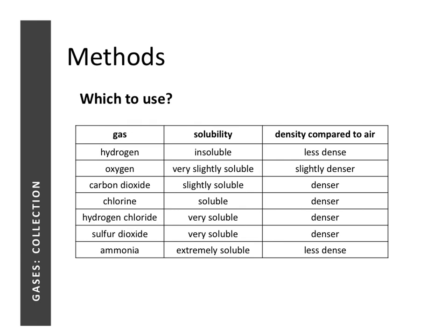So to apply what we have learned in the last slide, displacement of water can only be used for the first 3 gases. Okay, in fact, it's not ideal for carbon dioxide because carbon dioxide is already slightly soluble. However, it can be proposed for the first 3 gases.